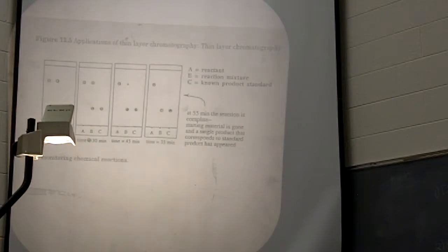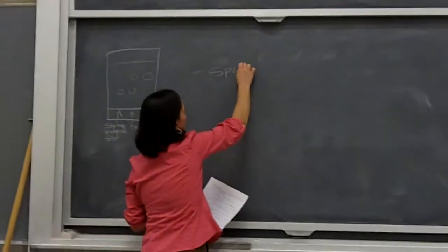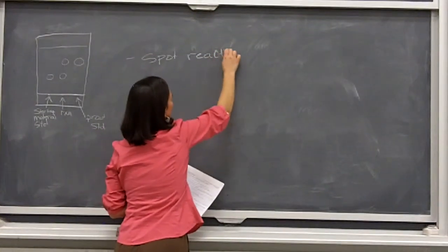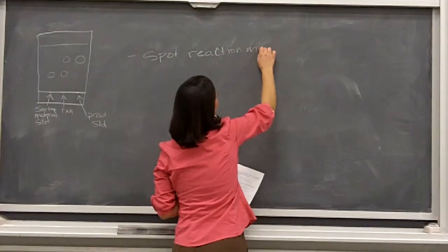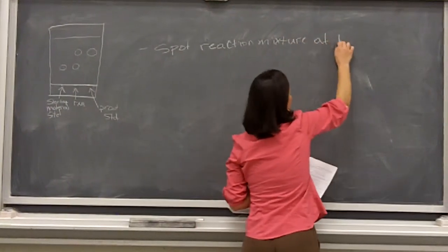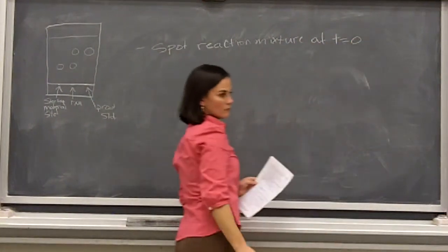So for the TLC, we're going to have you spot your reaction mixture at time 0.